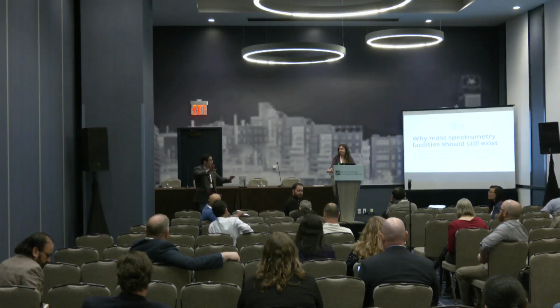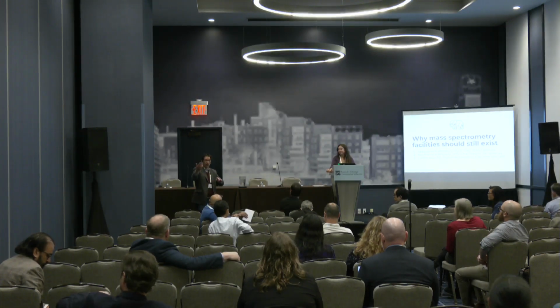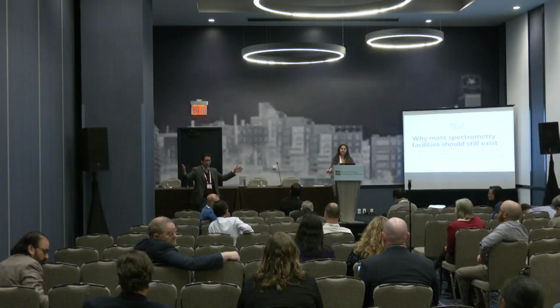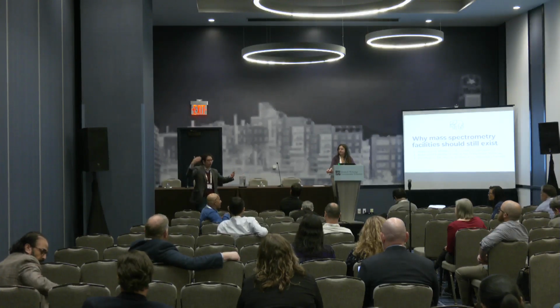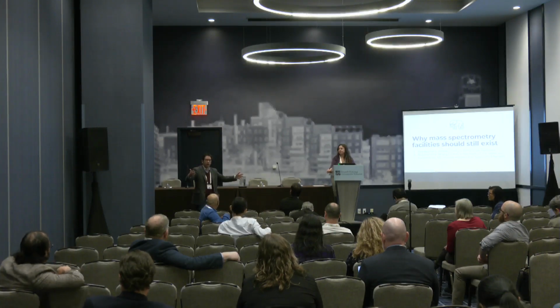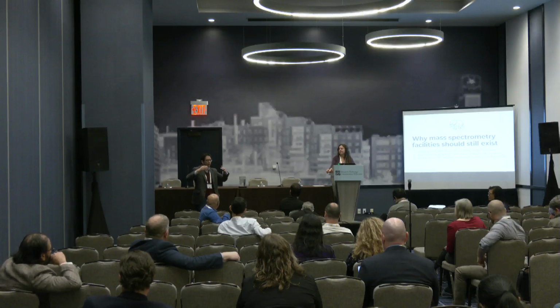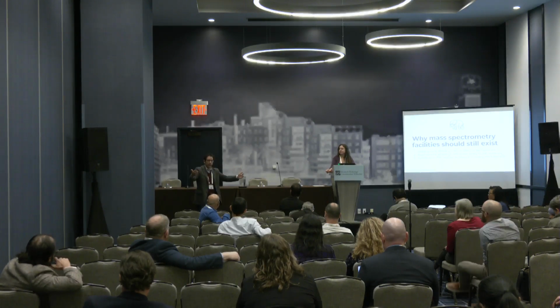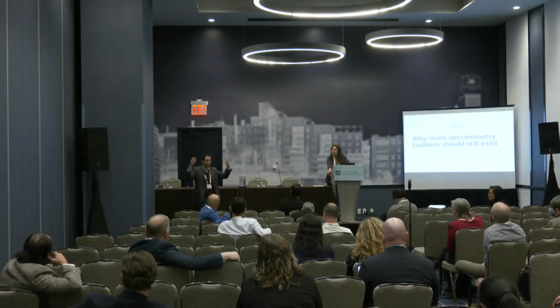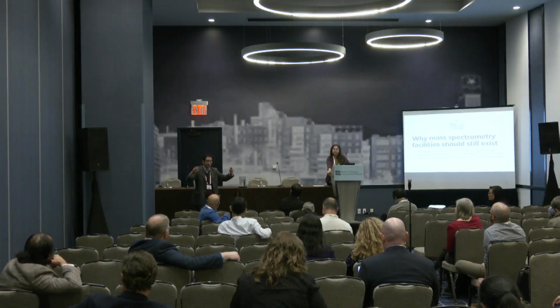Yeah, so I guess you can see this from multiple perspectives, and I think it depends on the flexibility of the core or the core director. And if the core director feels like they can sit up higher, bridging essentially multiple technologies, understanding what's going on with the mass spectrometer as well as with the sequencer, right? Then I think that actually works well. I would argue that it may be hard to find the people that can do that, and that's why thinking about it as there can be multiple cores that are collaborating together. That's another solution for this.